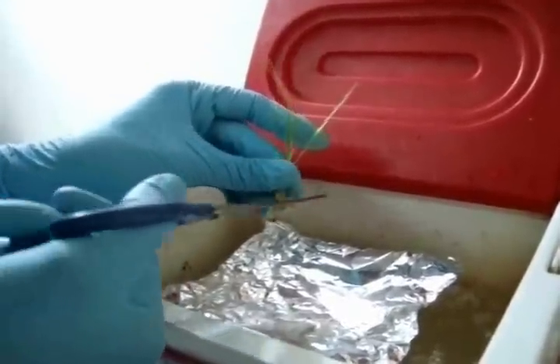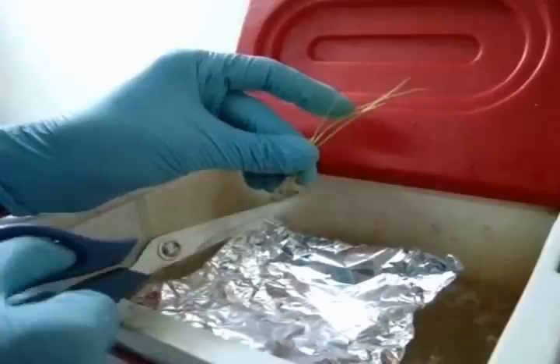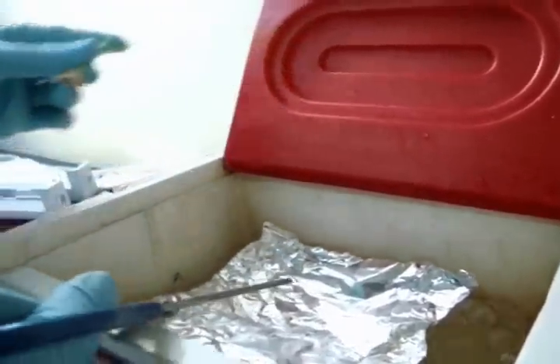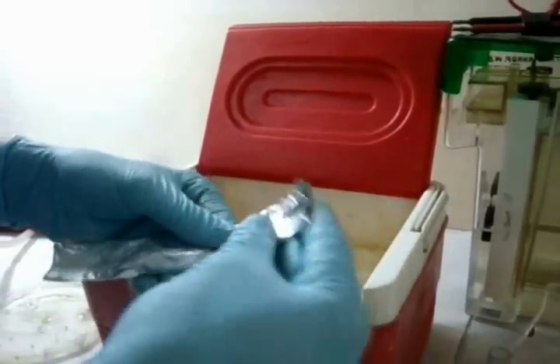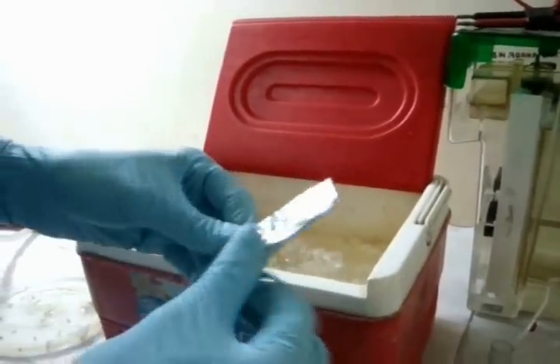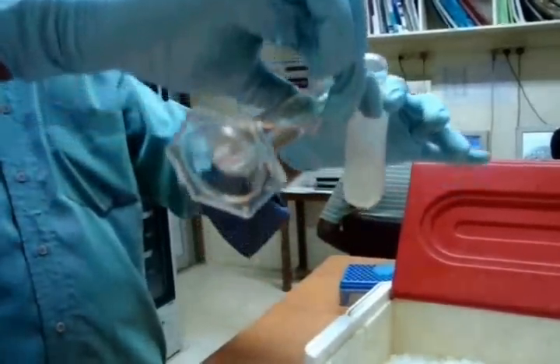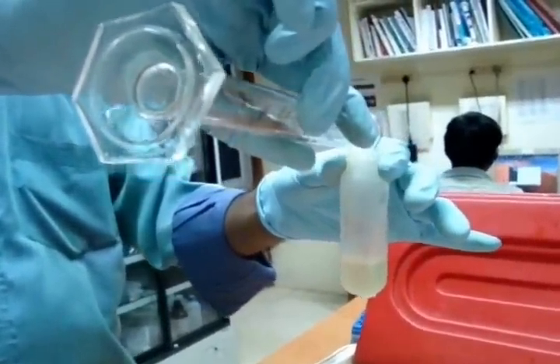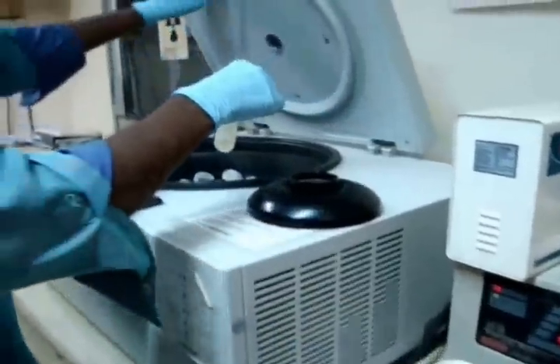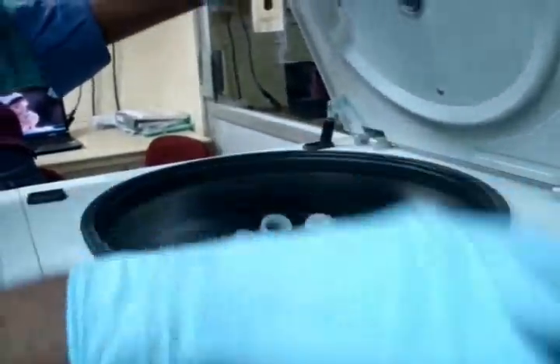The first step in 2D-PAGE is sample preparation and in-gel rehydration. The protein is extracted from the root sample. It is then ground, centrifuged, and stored at minus 80 degrees Celsius.